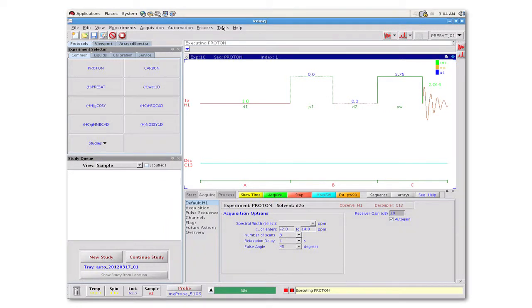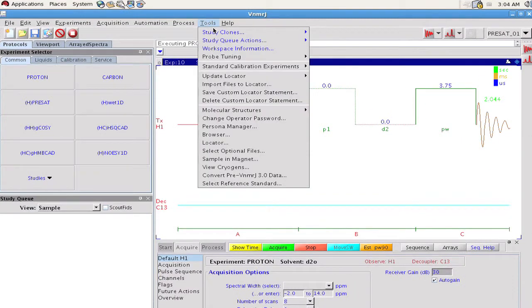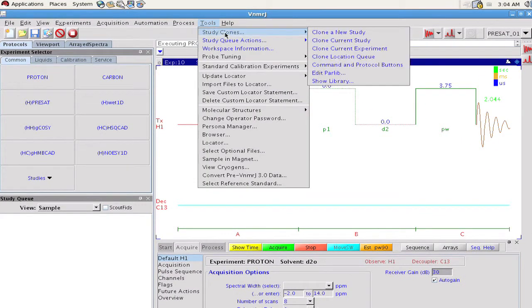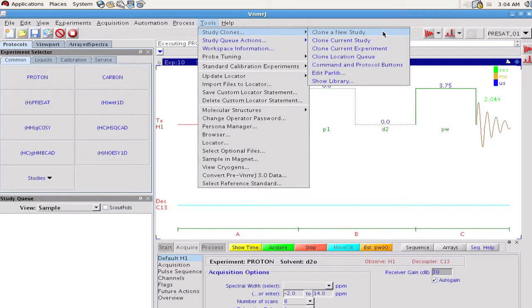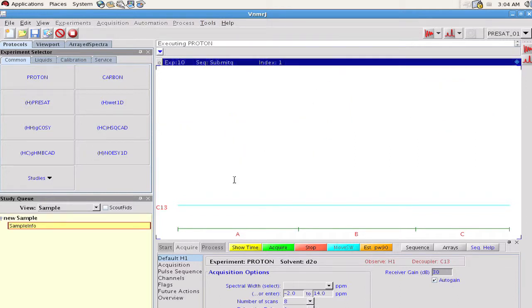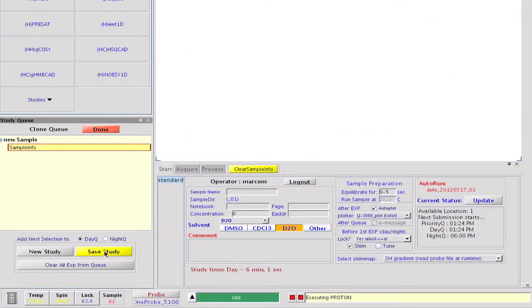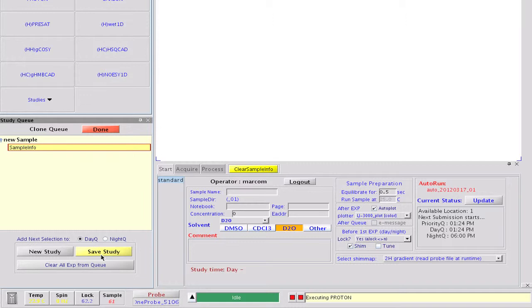First we'll consider a simple case such as the need to create a proton experiment that is optimized to provide proton spectra suitable for extracting sample concentrations. First we will select the clone a new study option from the study clones menu under tools. This moves the software into submit mode preparing for us to build a study. It also replaces the typical submit button with a save study in the study queue window.